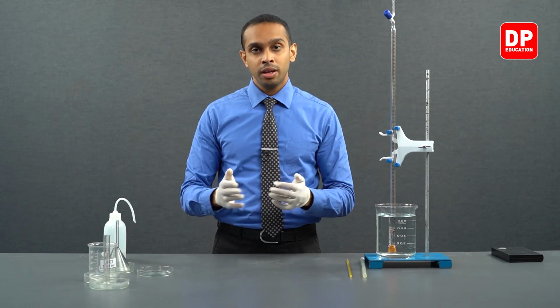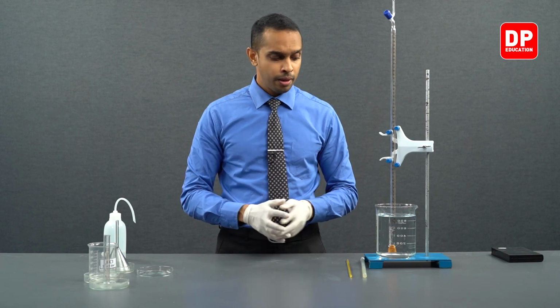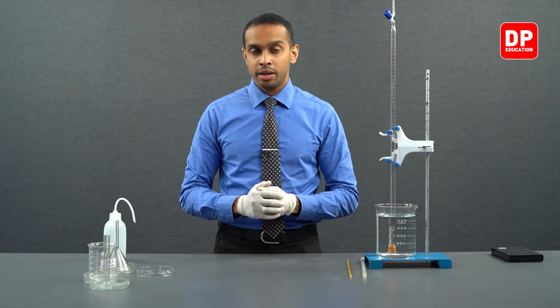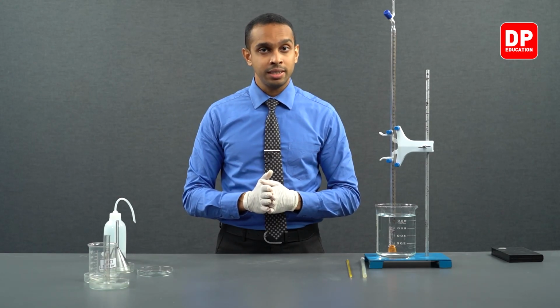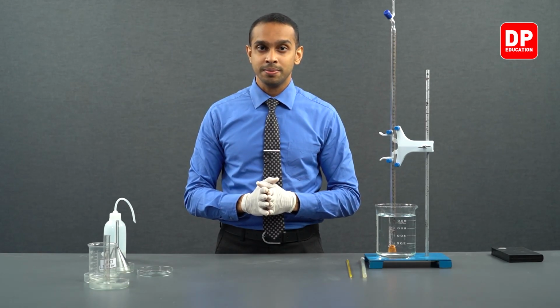Now, let's go over the readings we have obtained so far. In this third trial, we started with measuring the mass of the magnesium strip. Magnesium strip had a mass of 0.05 grams, and the volume of the hydrogen gas we collected was 49.9 cubic centimeters.